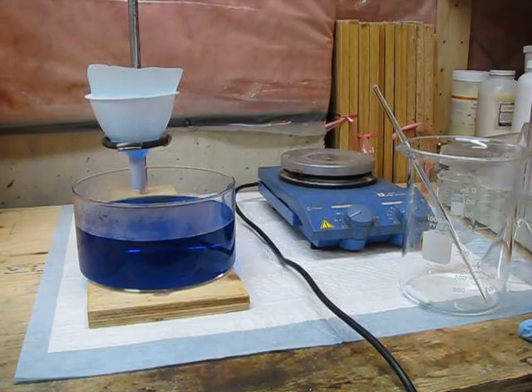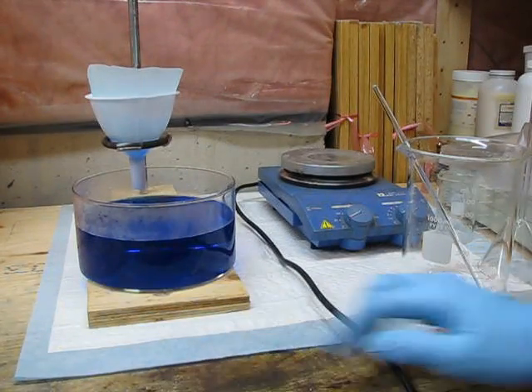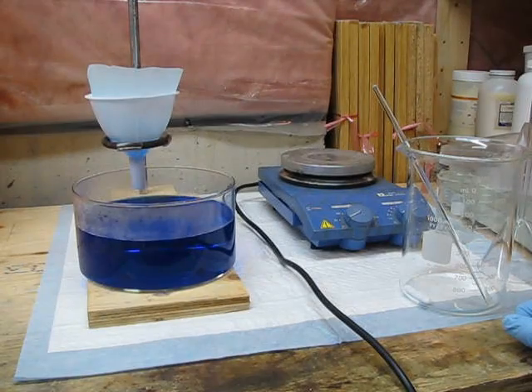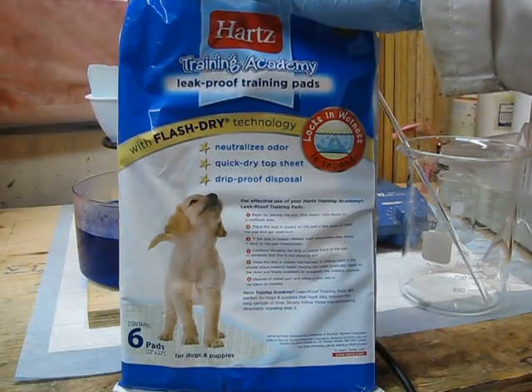I've discovered a neat little thing that you can get from the dollar store. This little plastic blue sheet with absorbent cloth glued on top of it. You'll never guess what it is. Puppy training pads from the dollar store.